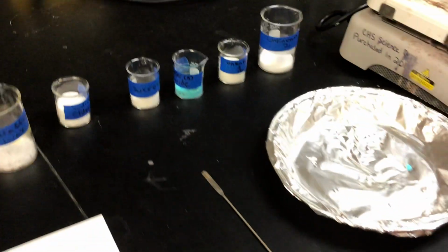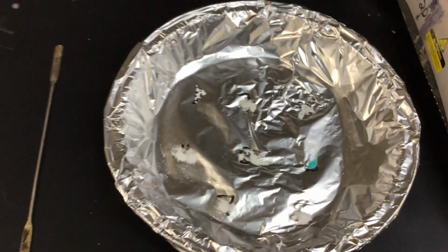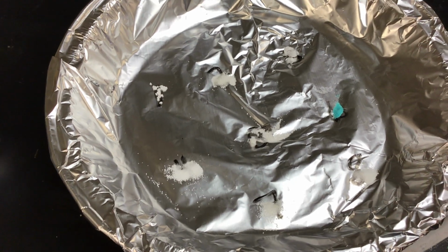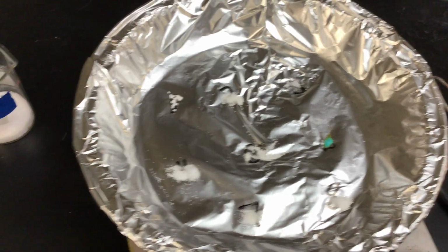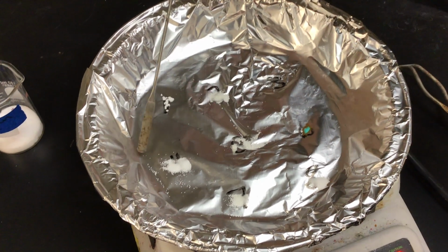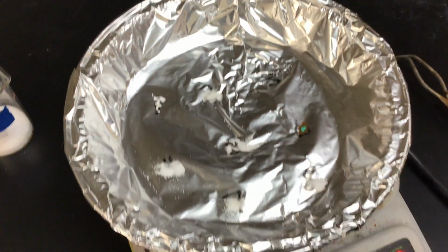Now, I've already made out the pie pan here, and I've numbered them 1 through 8, which is the order in which they're listed in your data table, okay? So now I'm going to put this on here, and we are going to wait for about 3 minutes. So here we have, I'm going to show you kind of what each one is. So right here, that's number 1, 2, 3, 4, 5, 6, and then 7 and 8, okay?